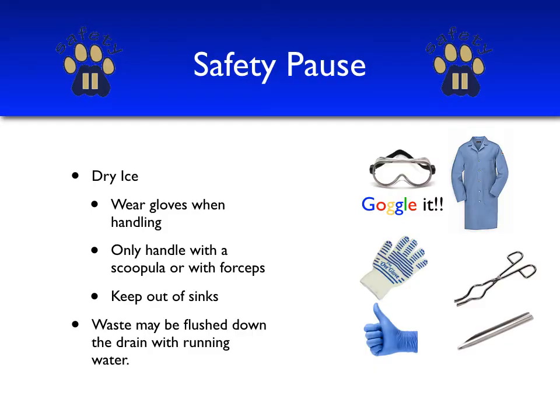For waste disposal in this experiment, all of the solutions can be flushed down the drain with plenty of running water, and any unused dry ice should just simply be returned to the cooler where it was provided.